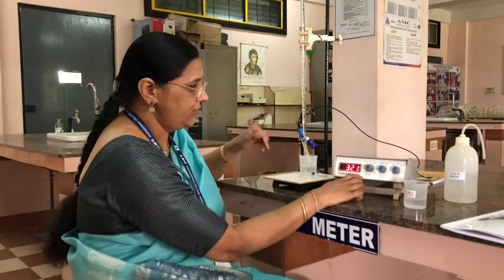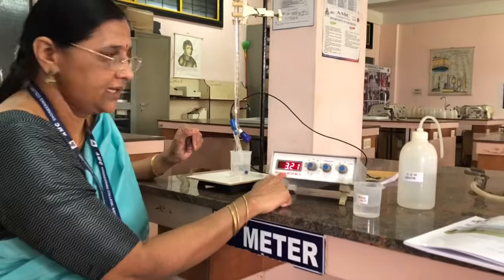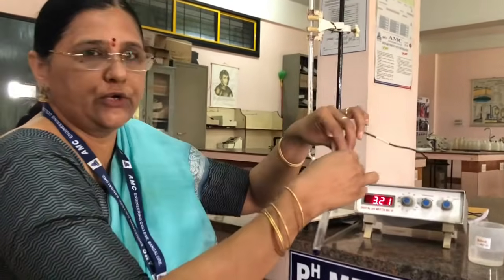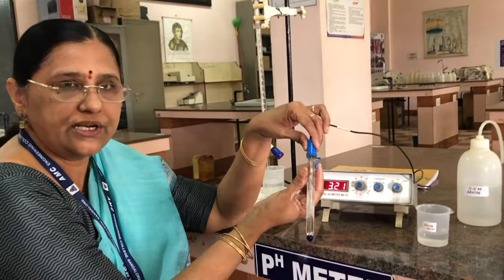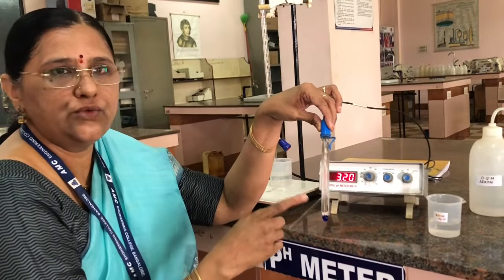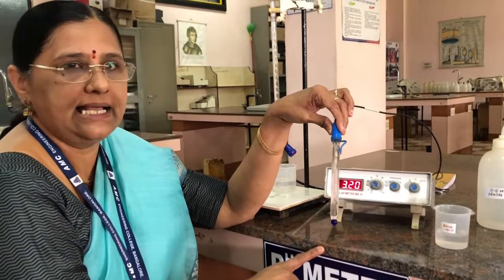Okay, now first I will explain the instrument to you. This is the pH meter, and it is connected to an electrode, which is the glass electrode. You have studied the construction and working of a glass electrode in your theory class, but the electrode we are using in this experiment is called a combined glass electrode.